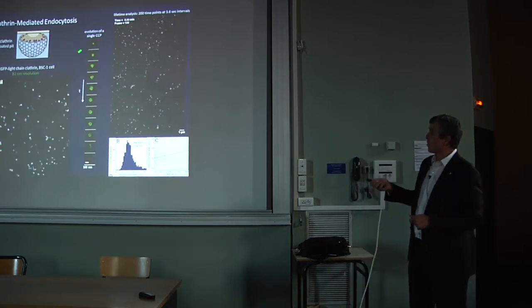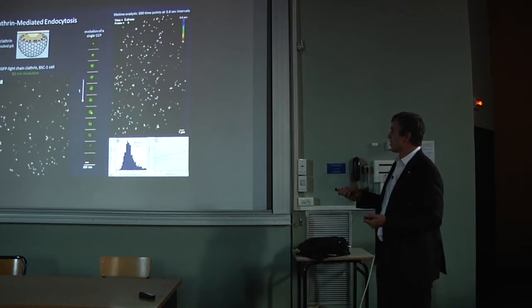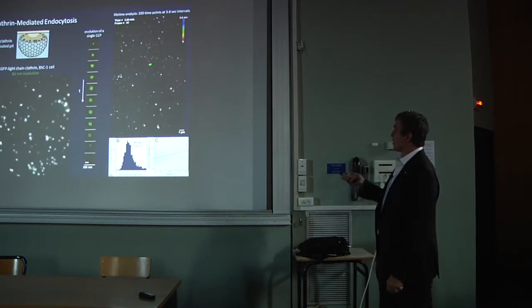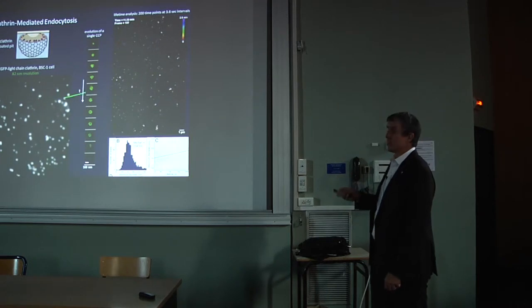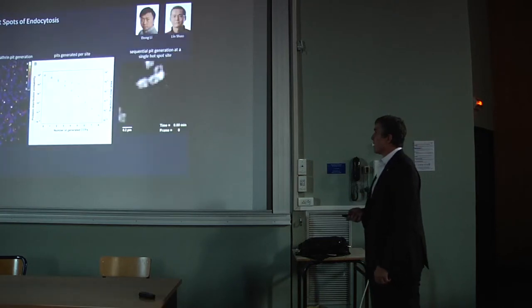But now that we can do that, we can actually follow the entire evolution of these clathrin-coated pits from their initiation, their maturation, and their eventual pinch-off and internalization. And so we can then track the lifetimes of these, shown as the different colors here, and correlate the changes in size to the lifetimes to find the rates of growth and find other correlations as well.